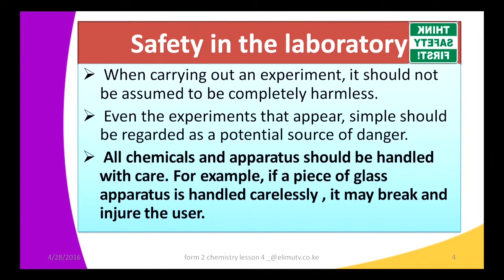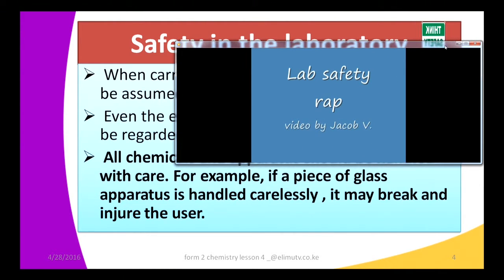Now, as a result of this, we want to have various demonstrations that will help us understand safety in the laboratory. So I hope you're going to enjoy and participate in these demonstrations. So let's have a look at this.